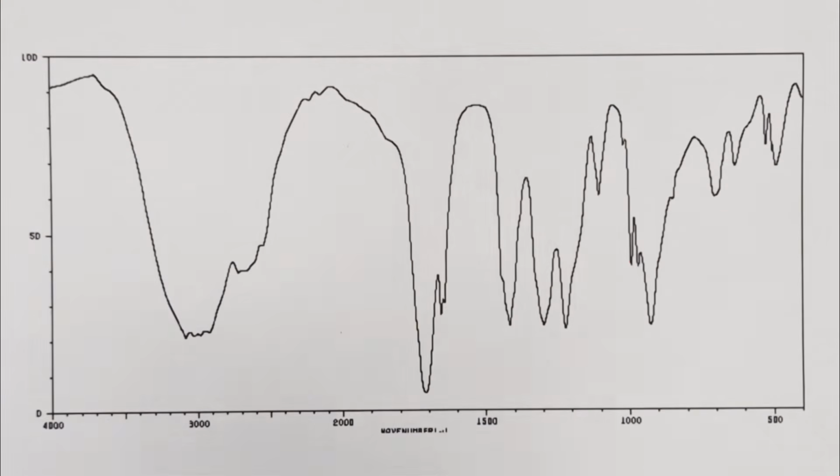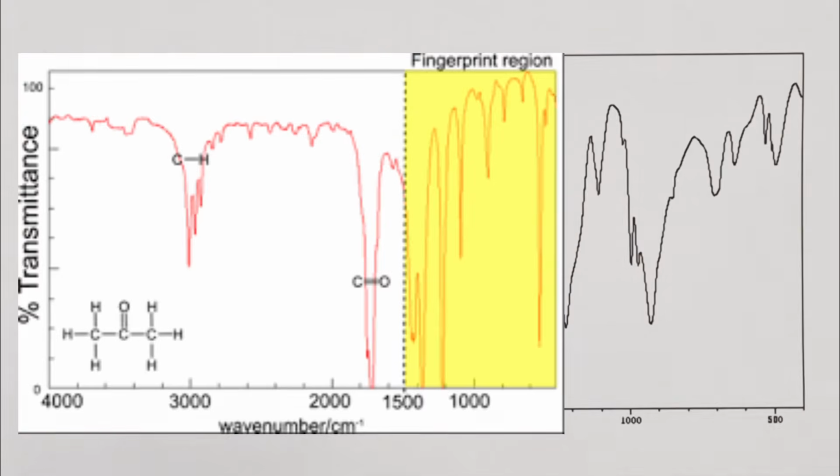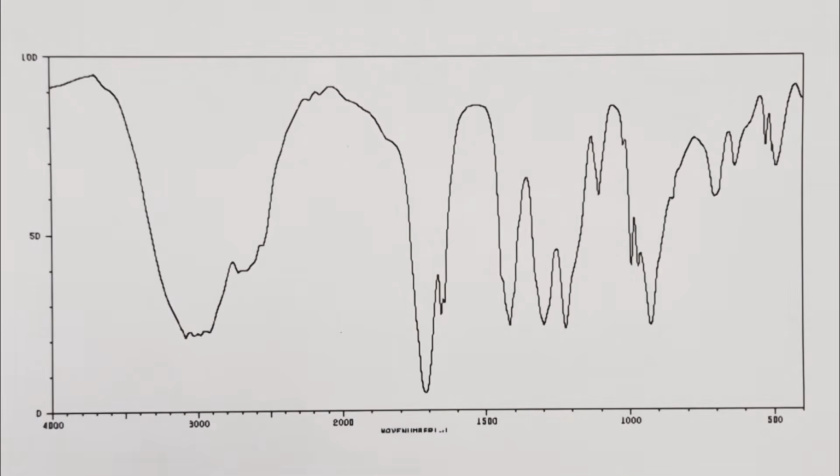Right guys, take a look at this second infrared spectrum. It has some similarities to the previous example, but also some brand new troughs you may not be familiar with. First thing to talk about is this area down here below 1,500. This is often known as the fingerprint region, and what you'll notice is it's rather confusing. Lots of various troughs going on, really hard to interpret.